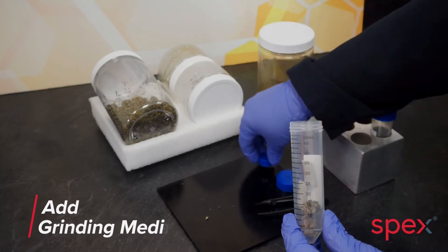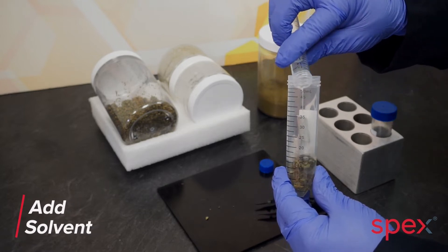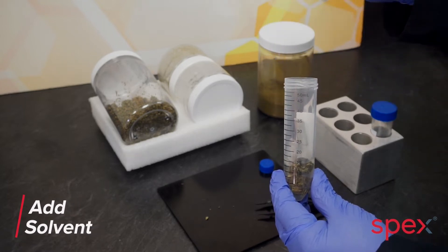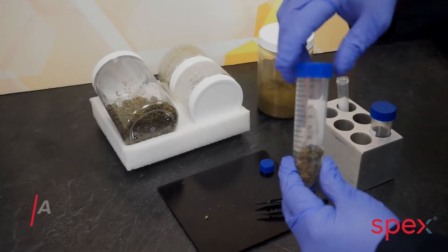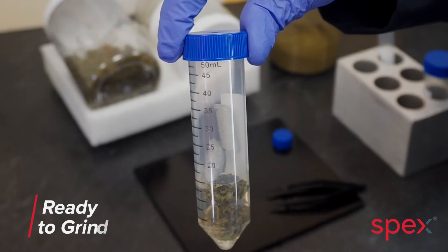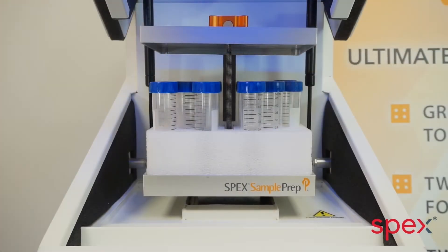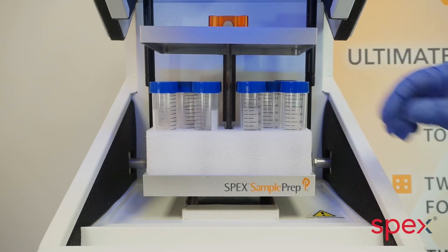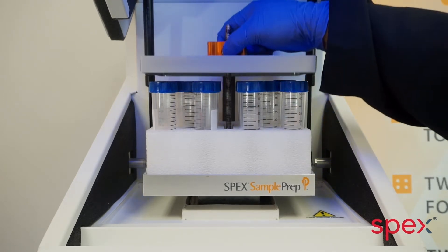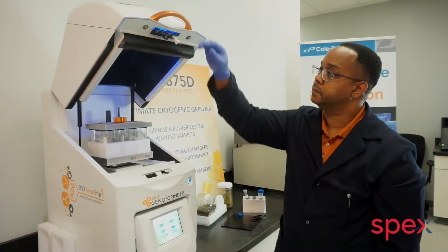After the samples have been prepared, they are loaded into the Geno Grinder. The Geno Grinder clamp can accommodate 16 sample tubes. The clamp lid is lowered and locked into place, then the lid is closed.